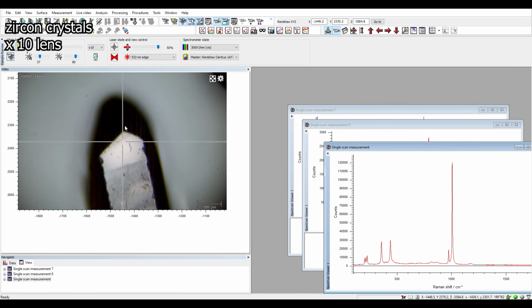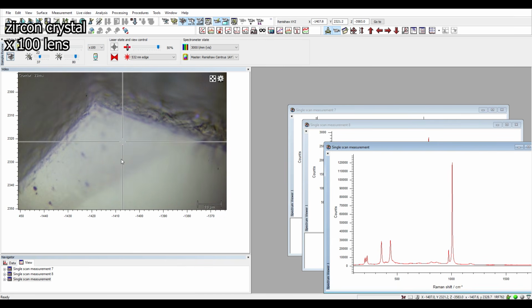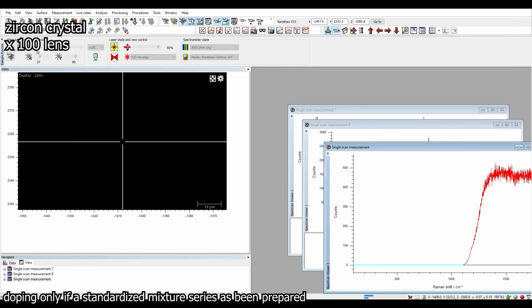reappear. The beauty of Raman spectroscopy lies in the fact that virtually no sample preparation is required, and the sample itself remains undamaged. It is therefore a non-destructive analytical technique that can be effectively utilized at the very beginning of an analytical workflow. It allows for the determination of various properties, including crystallinity, chemical composition, doping levels, and even temperature. Higher temperatures result in increased molecular vibrations, which in turn alters the Raman scattering patterns.